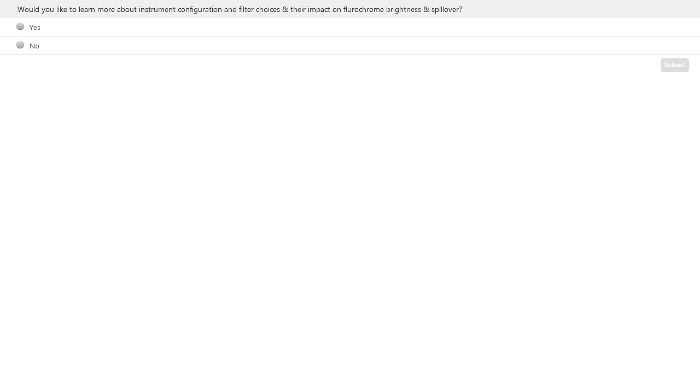Understood. Thank you, Ravi. Thank you, Bob. So the next question is from Alexandro at UCLA, and Karina from Case Western has a similar question, so I've tried to club the two together. Both want to understand what it means, Bob, when you say the color at the end of the laser. And Karina wants to understand how we would know which is the first color for the laser. Any tips and tricks for them?